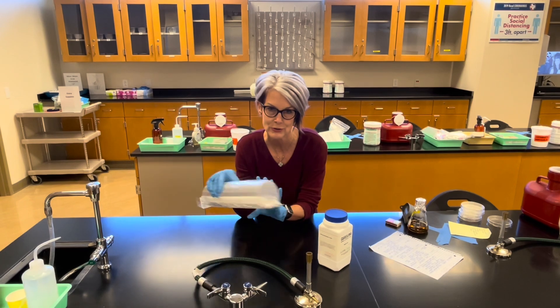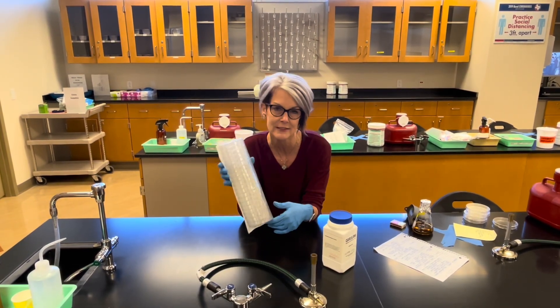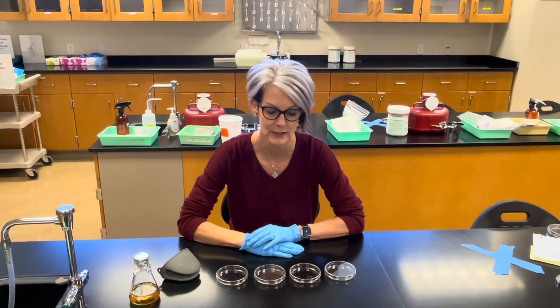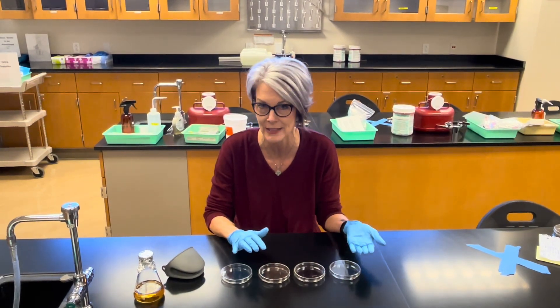We also use disposable petri dishes, and they come sterilized in a prepackaged sleeve. Before you get your flask of media, arrange your four petri dishes in a row with the bottom side down.